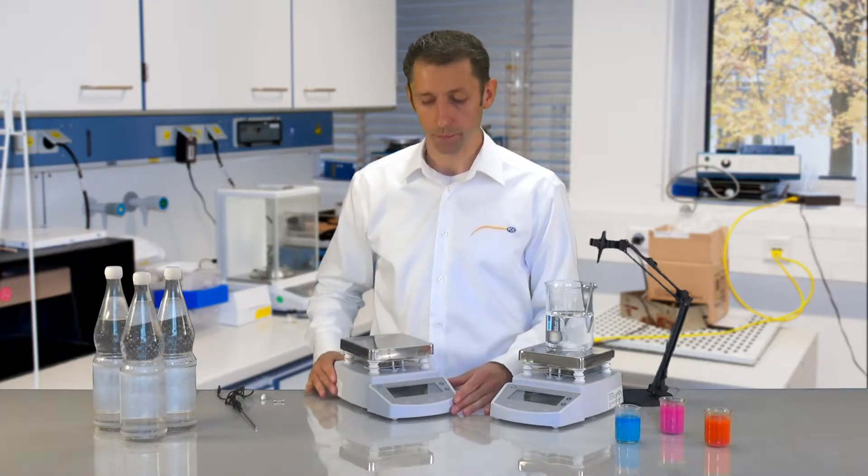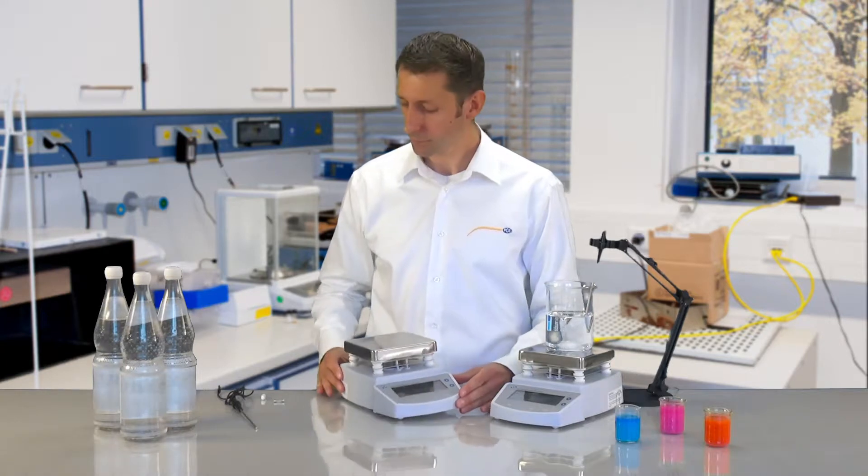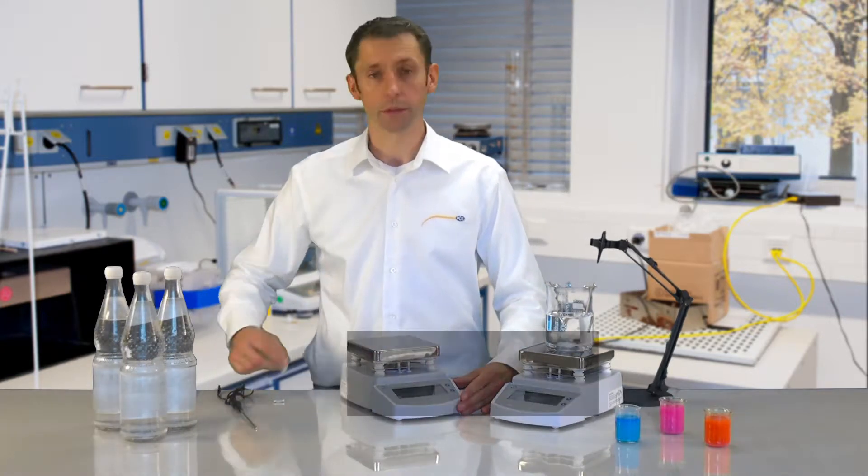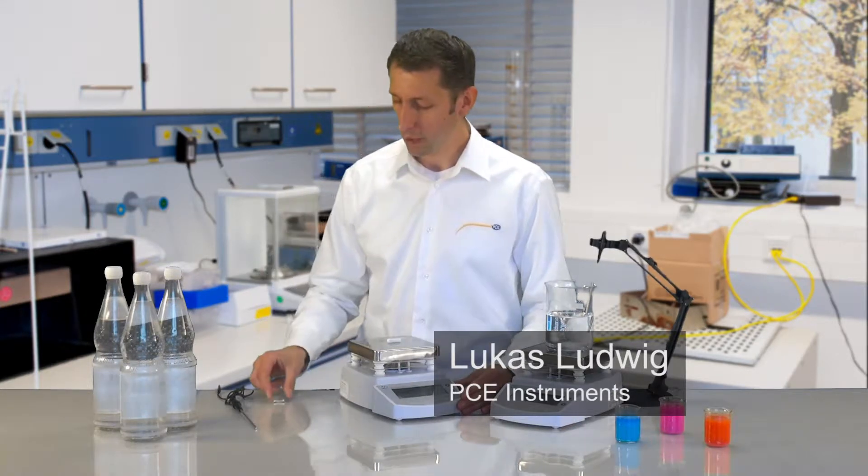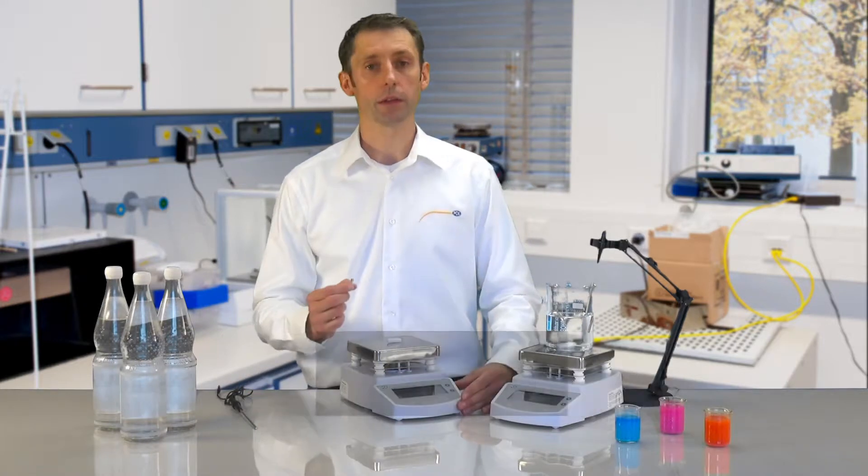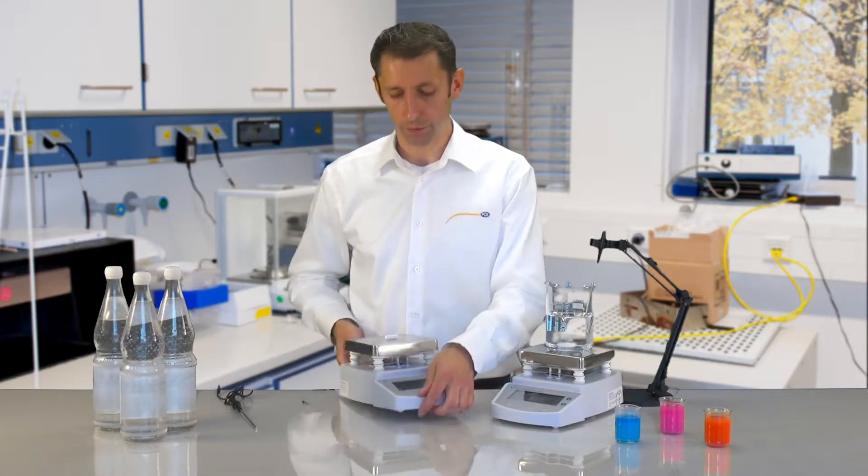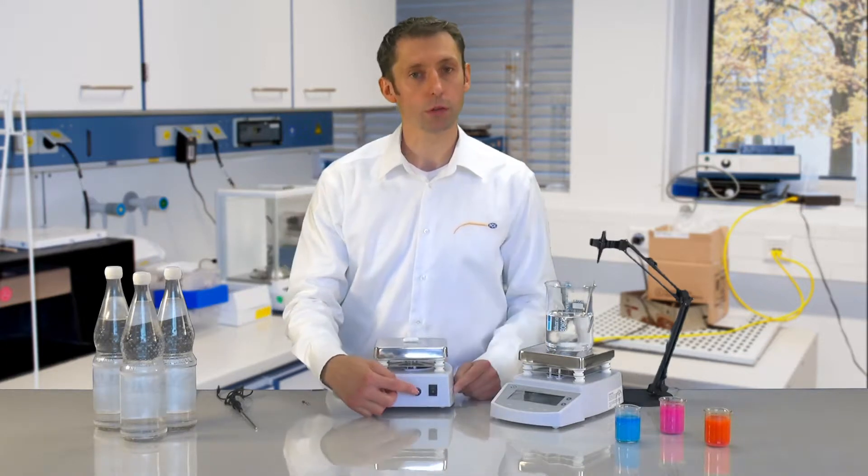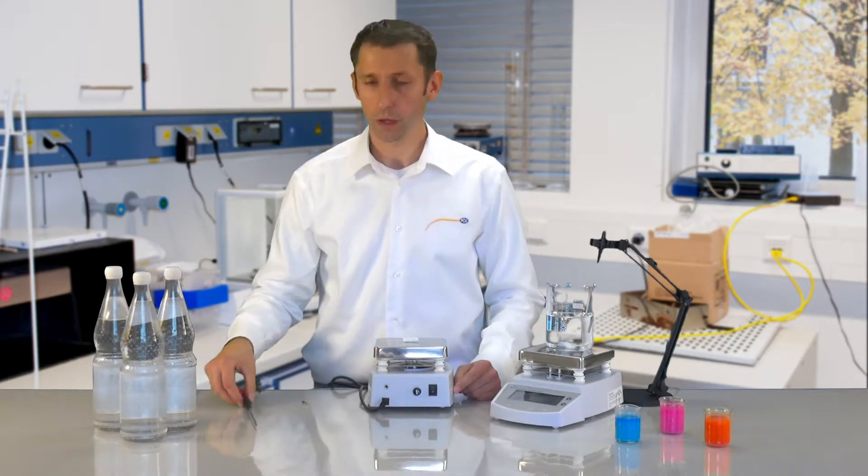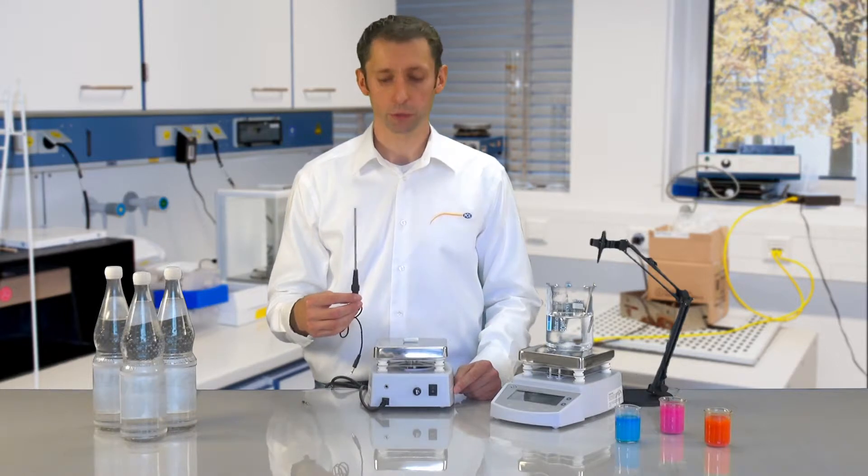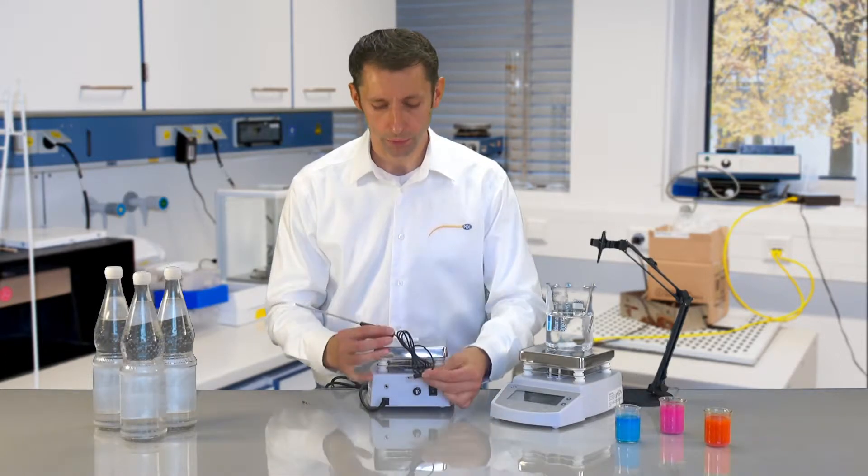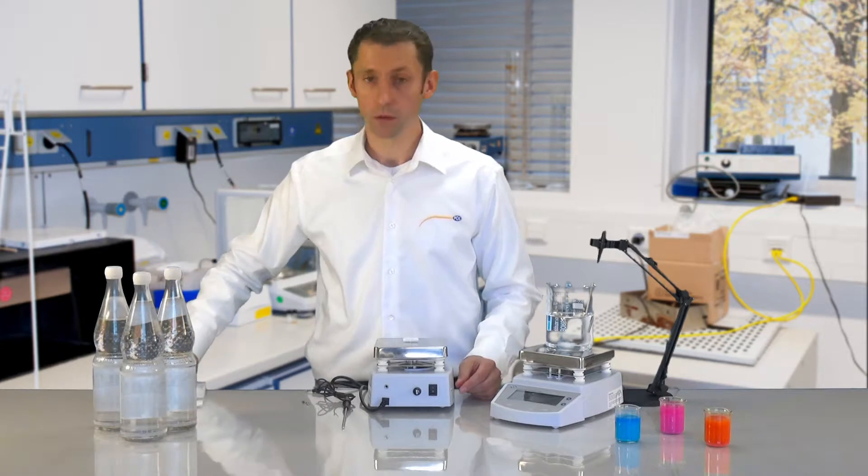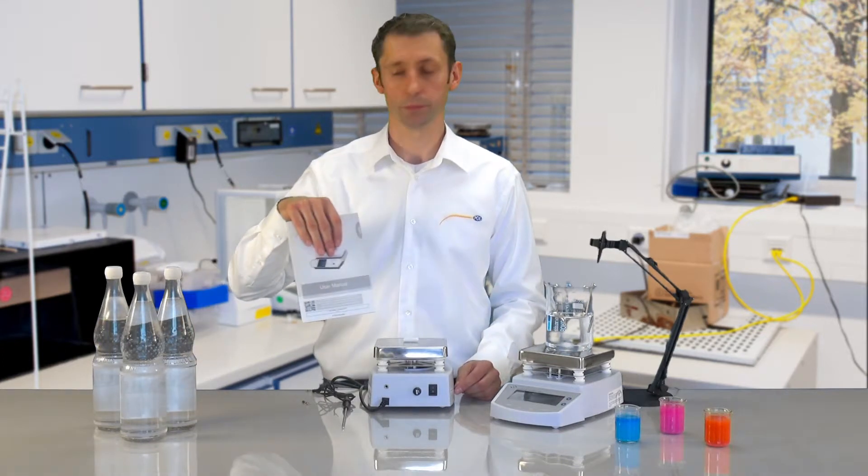In the delivery we have the magnetic stirrer itself, a 30mm stirring rod with a PTFE covering, we also have a spare fuse for just in case which can be changed on the reverse side of the magnetic stirrer, as well as a PT100 temperature sensor which is also connected to the reverse side, and also the user manual.